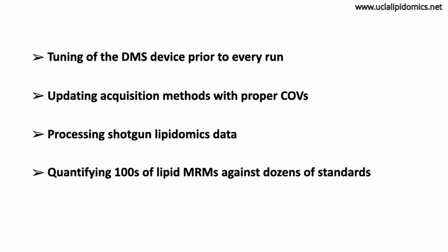While the Lipidizer managed these processes, it had a number of limitations. To overcome these limitations, the UCLA Lipidomics Lab has created the Shotgun Lipidomics Assistant. The Assistant can be downloaded as a standalone executable and run alongside Analyst to facilitate the workflow. It was developed in Python and is an open source application.